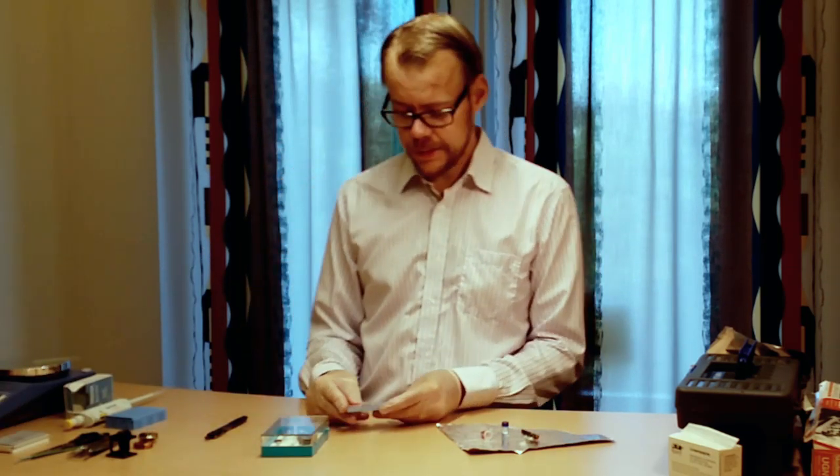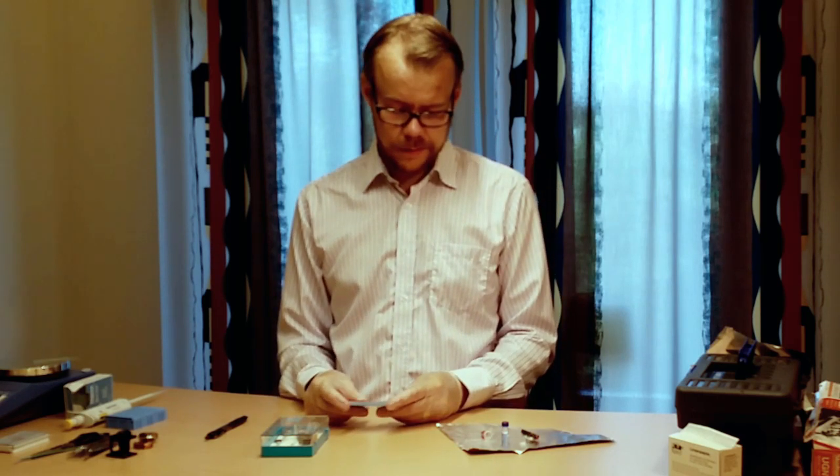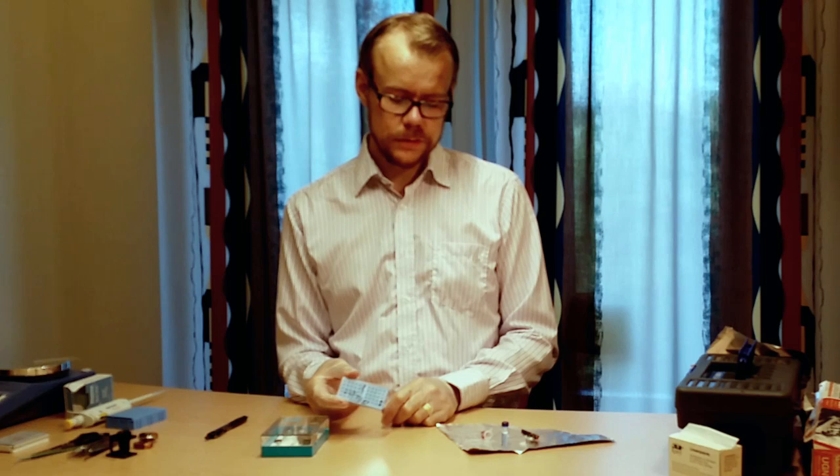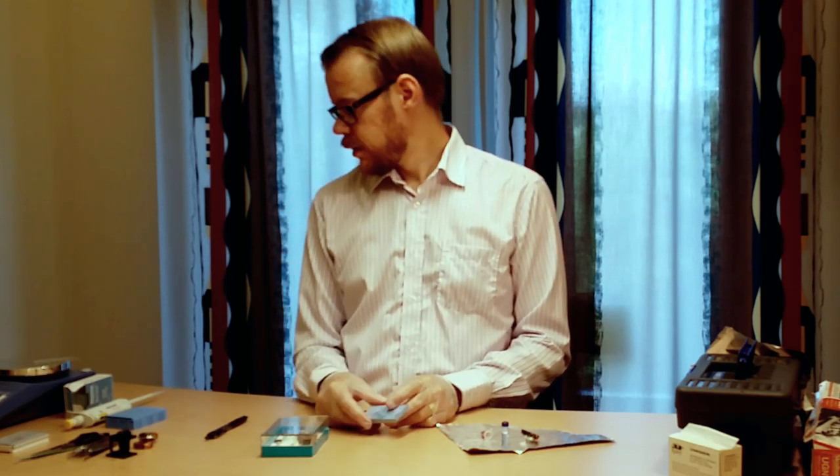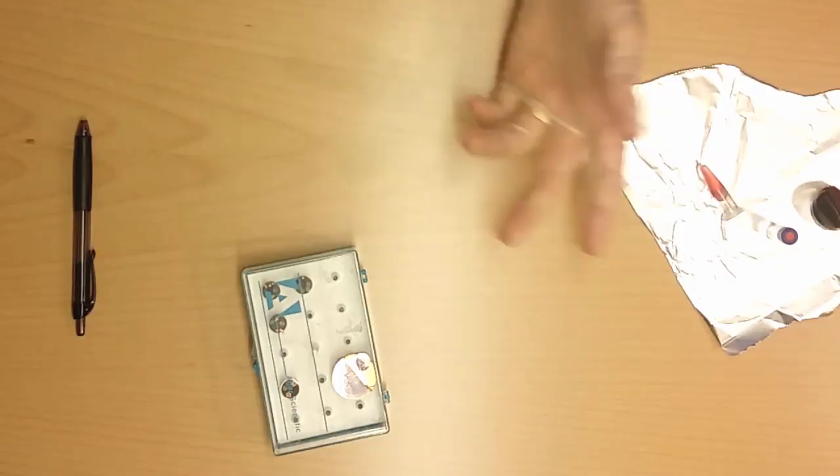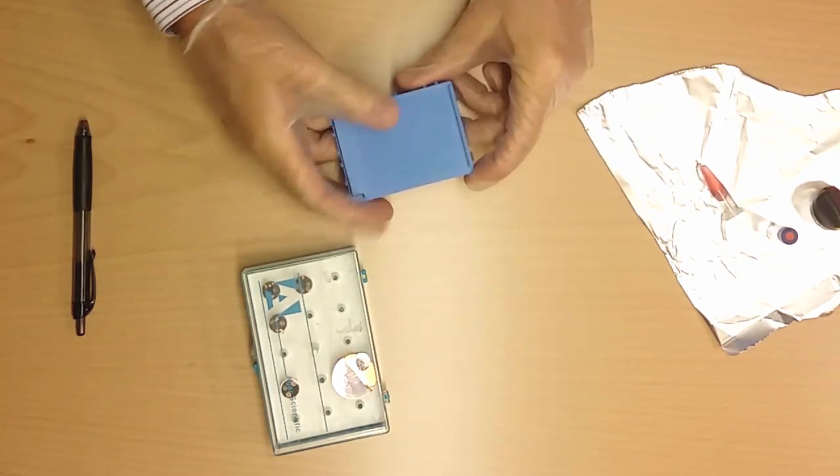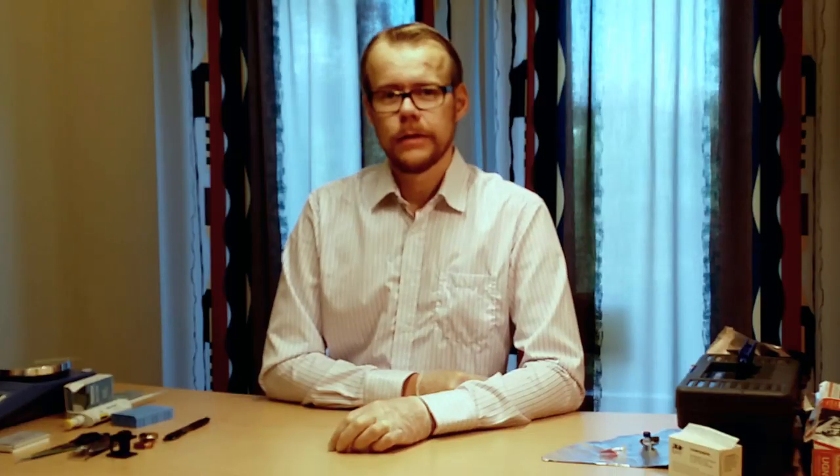Otherwise if it's just standard TEM grids with suspension or something, then you just use these default boxes. Bigger materials and things, good to have a plastic box like this. Yeah so that's it. Some general information on the tools that you need to do some basic sample preparation for microscopy. And I also discussed some of the techniques. These techniques I will show you in more detail in another video.